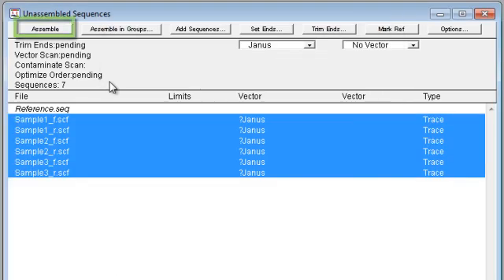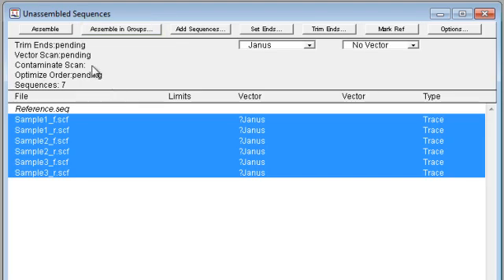Then click assemble to assemble all of your data together or assemble in groups to assemble into contigs based on sample names.